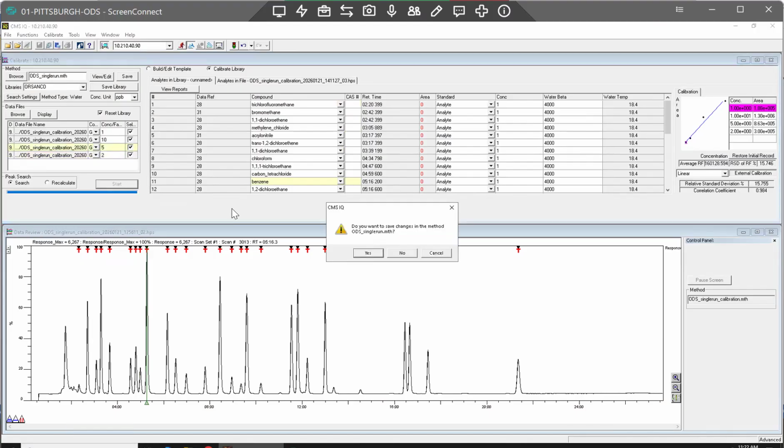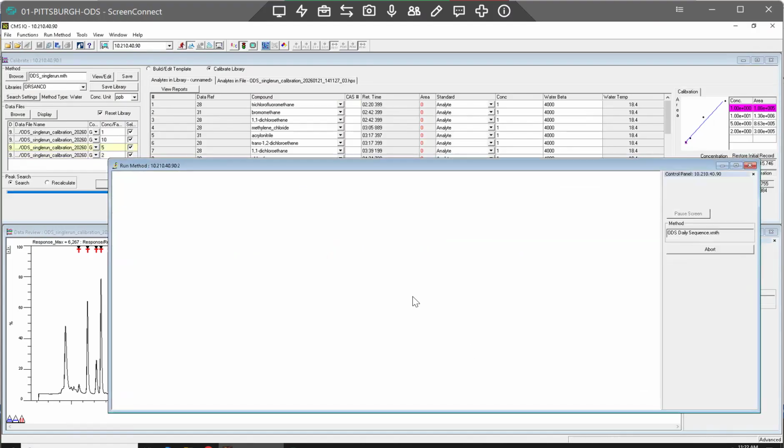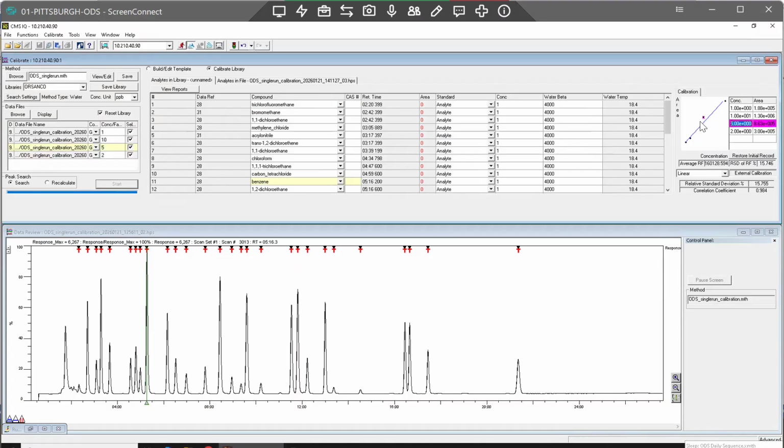Uh-oh. What's this doing? I'm not sure. Oh, okay. That's why. I just finished the run. Okay. So anyway, I'm not entirely positive if you can turn off any of these points.